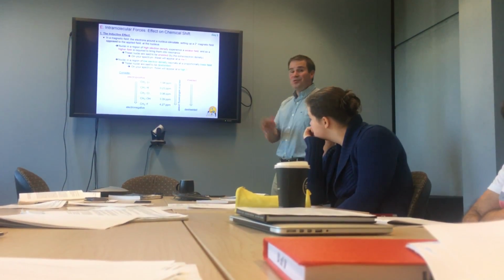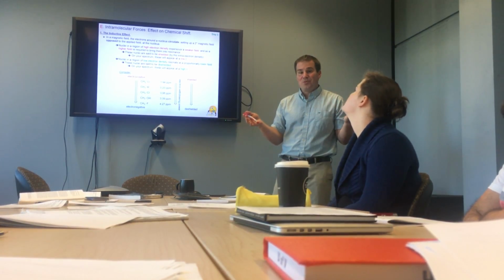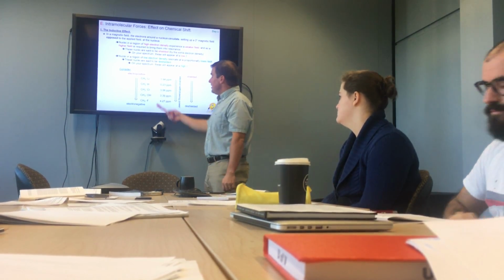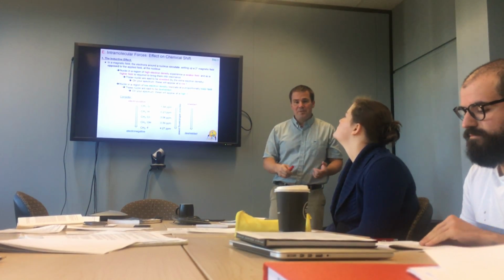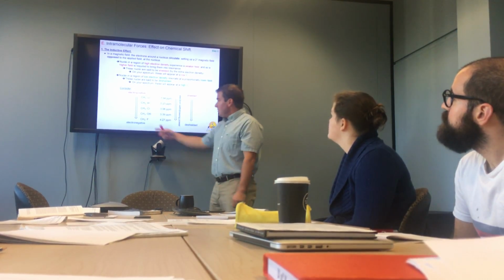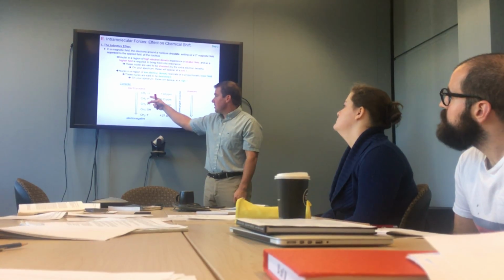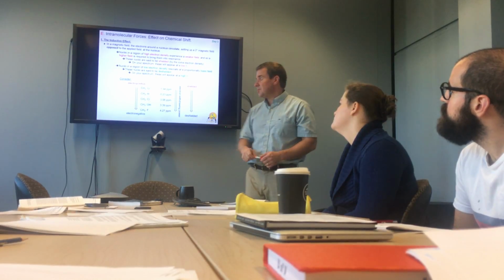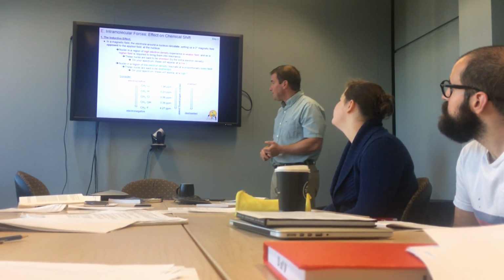So, let me prove to you now that this works, because I think this is really cool. We think of chemical shift numbers as kind of arbitrary sometimes, but this is really where this is coming from. So let's consider a series of methyl groups attached to a bunch of different elements. We'll work from electropositive to electronegative. Fluorine is more electronegative than oxygen, is more electronegative than chlorine, is more electronegative than a hydrogen atom, is more electronegative than lithium. Everybody probably knows your electronegativity series. And if you don't, there's a periodic table on the next page.